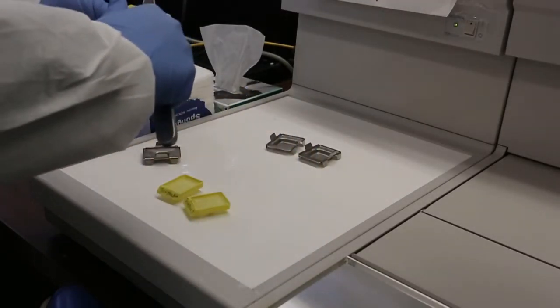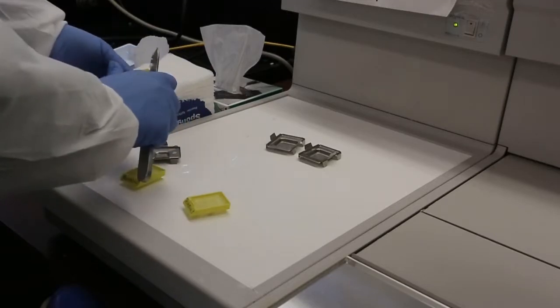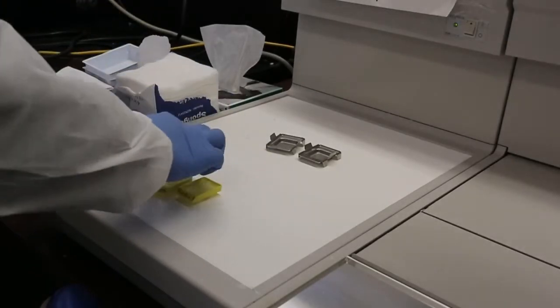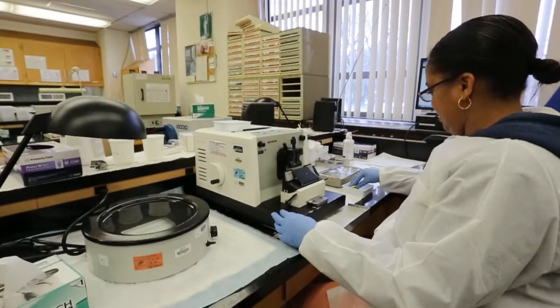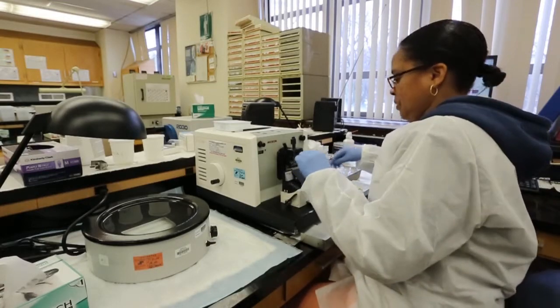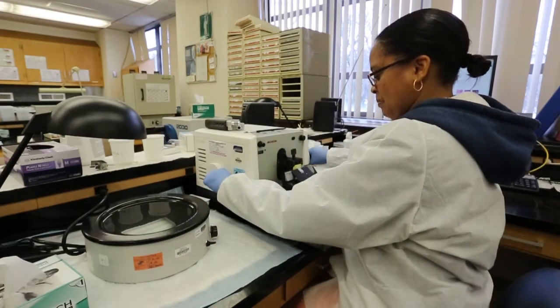I'll usually scrape the sides just to get the extra paraffin off, and then bring them over here. Now I'm going to face my blocks. I'm going to lay it in my microtome first. This is facing — I'm going to face my blocks.